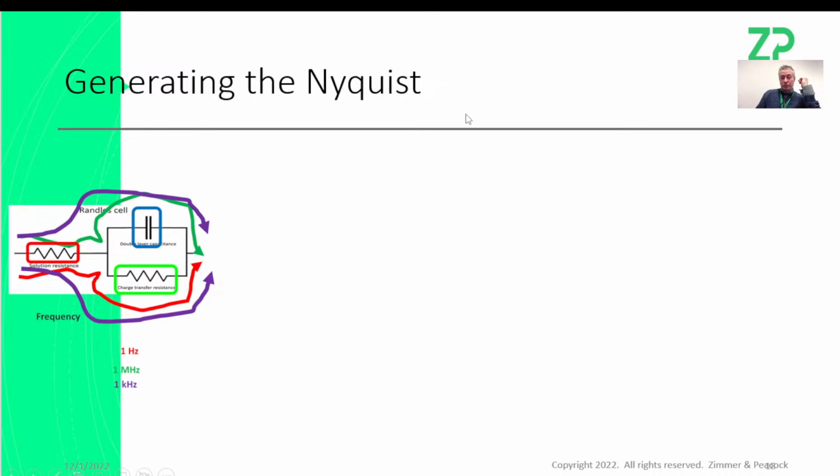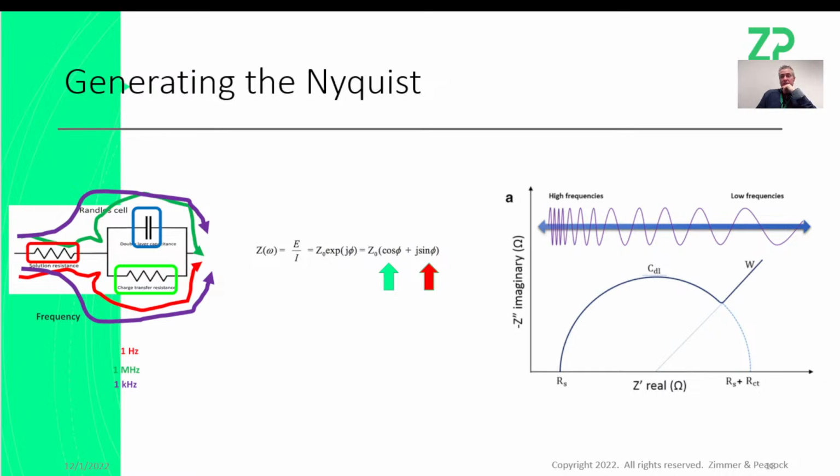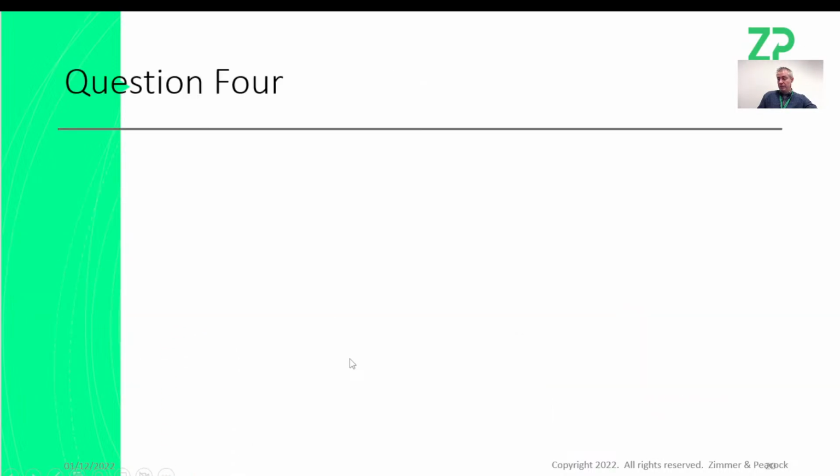These are some of the slides from our workshop. So if you're not familiar with EIS, I do have some videos online, but we also do go through this in quite a lot of detail about the meaning of these signals and how to interpret these signals in those particular workshops. So in answer to your question, Troponin I is not something that we're able these days to just sell on the web store. It's there, but we do use it on client projects. It's essentially like an immunoassay, and we read it by EIS. So those are the details I'm able to give. But of course, if people want to come and do some large projects with us, then they're happy to discuss it on the actual project itself.